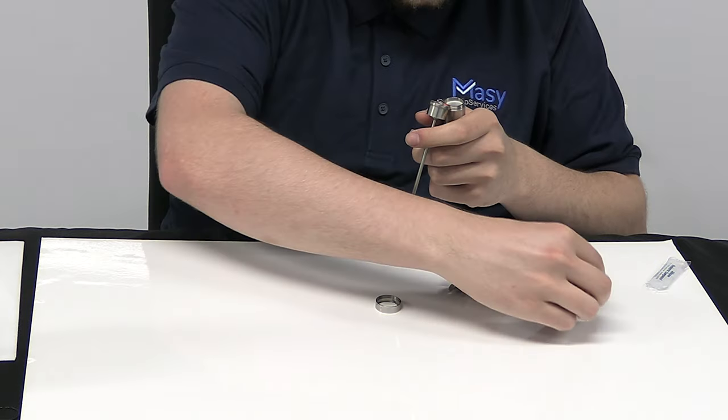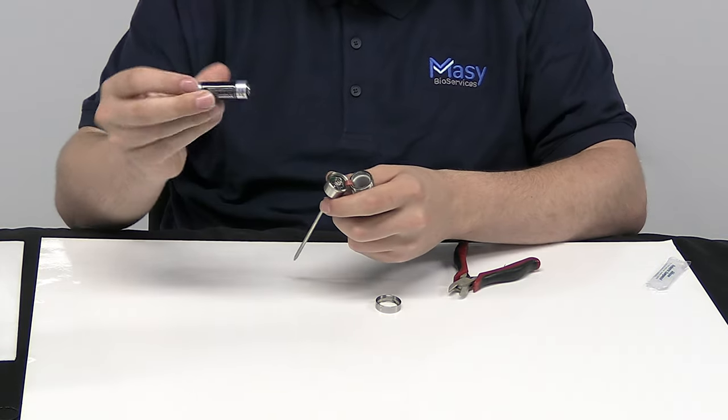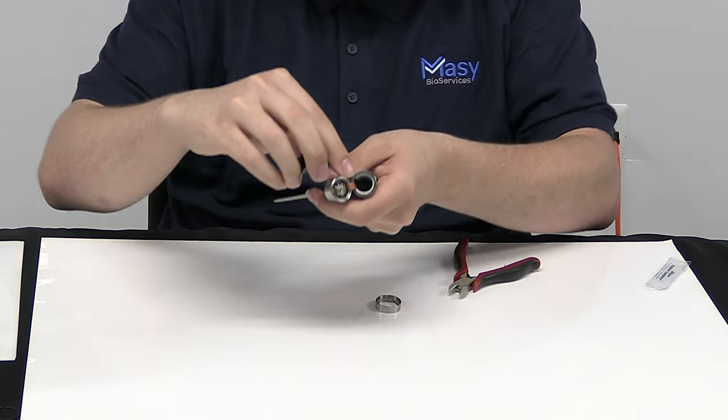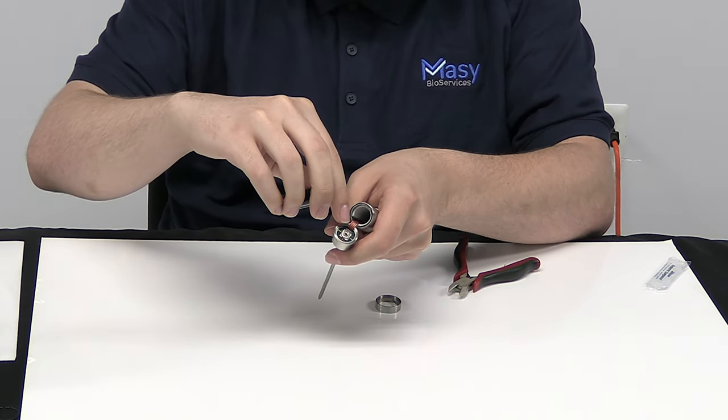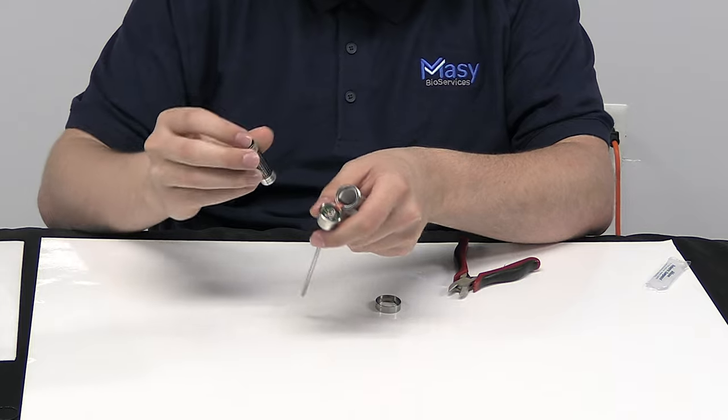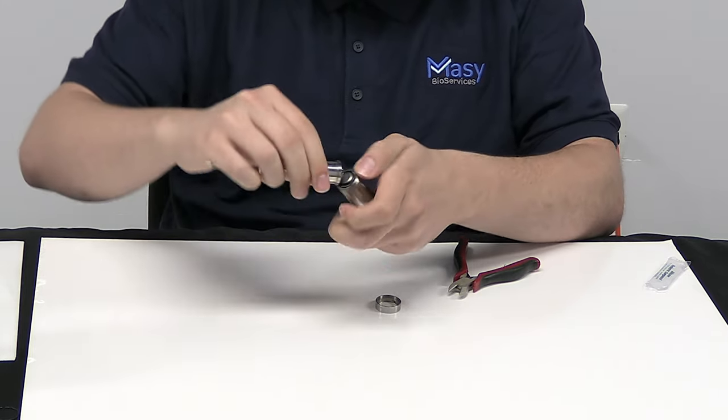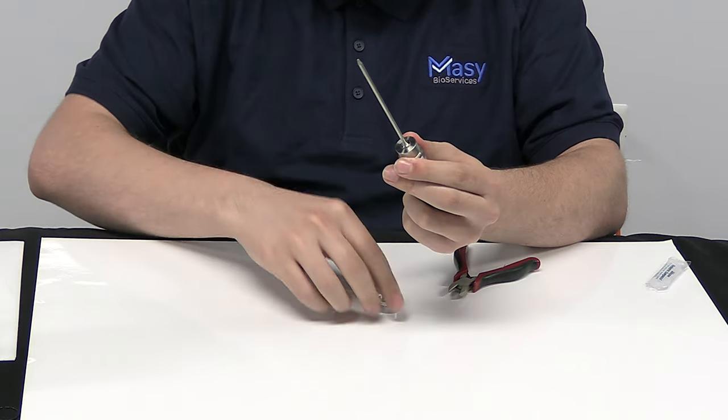Once snugly in place, we take our new battery and ensure that the positive side is facing downwards and the wire on the data trace is in that little groove there. The battery should slide in snug and we close the unit over the top.